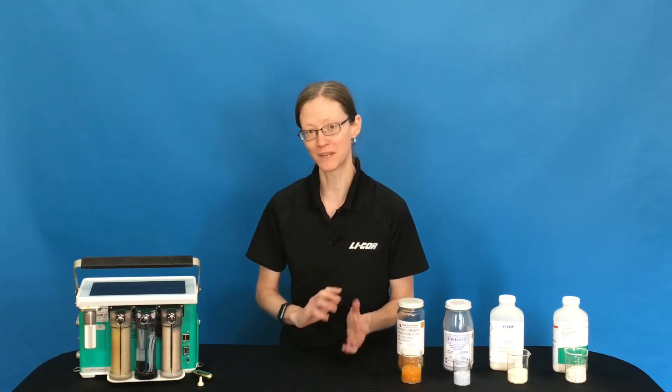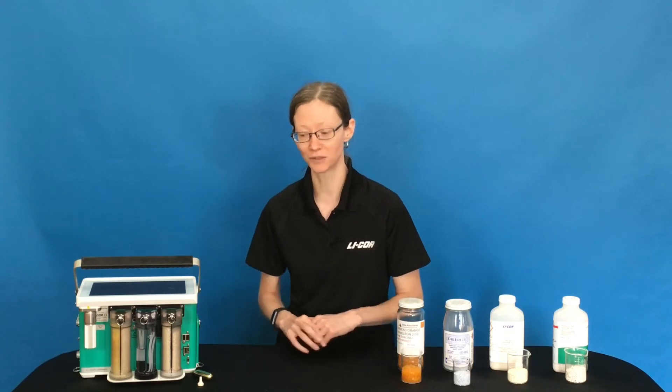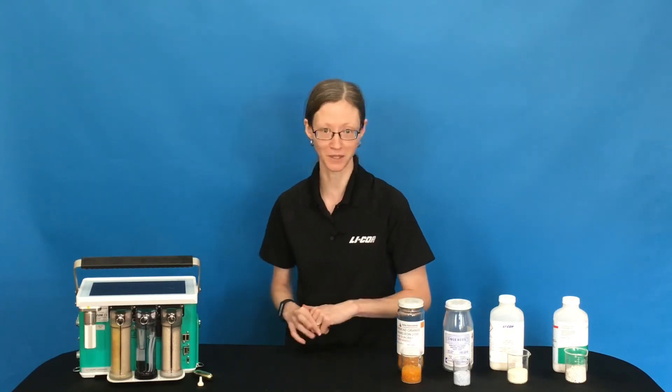If you're transitioning from the LI-6400 to the LI-6800, you'll notice that we have three columns now instead of two. The reason we have three columns is that we have an extra column to add water, and I'll talk about that just in a bit.